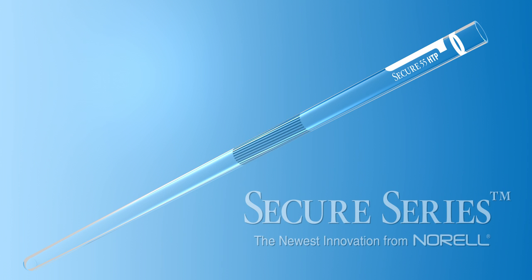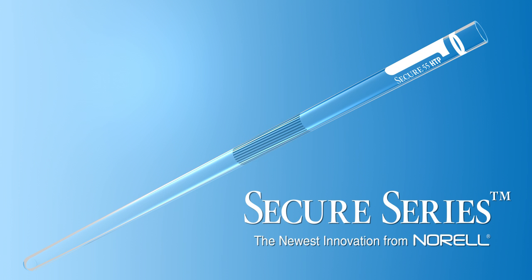The Secure Series NMR tubes remain completely compatible with standard, classic NMR tube caps in both 5 mm and 3 mm sizes.